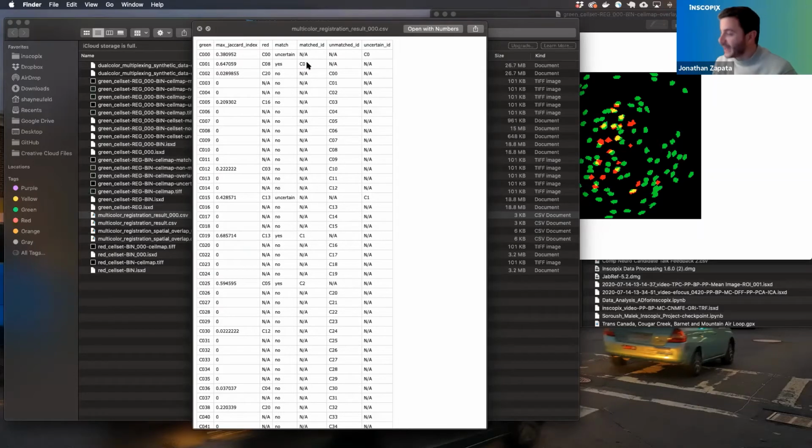Hi, Shay. John, I have a quick question. Probably a stupid question, but so basically, when we use PCA-ICA versus CNMF-E for the cell identification, I guess we will identify different kinds of components, PCA-ICA components, and for the CNMF-E, ROIs, let's say. Do you think that if we use one or the other, we can get a different overlap that is basically based on the identification per se of the ROIs? I don't know if I'm clear.